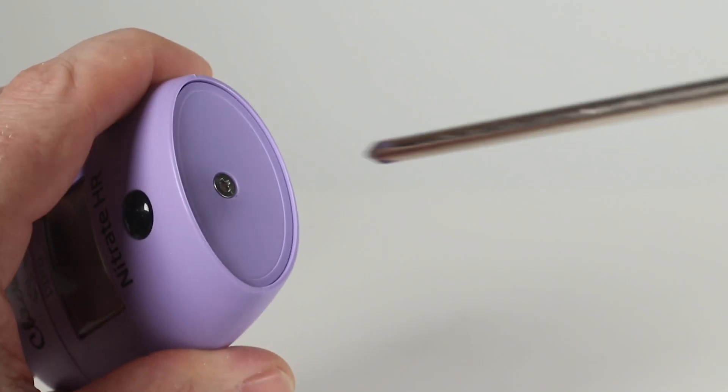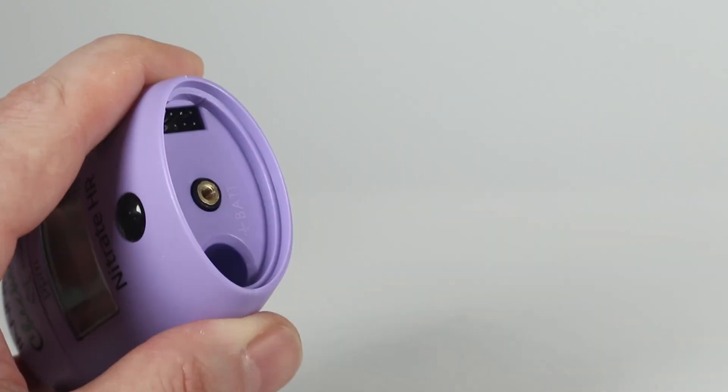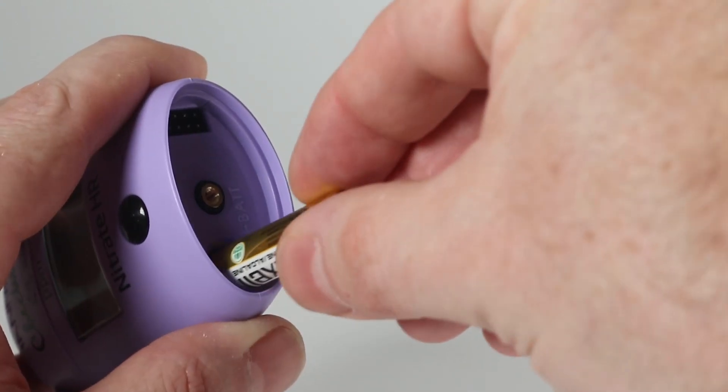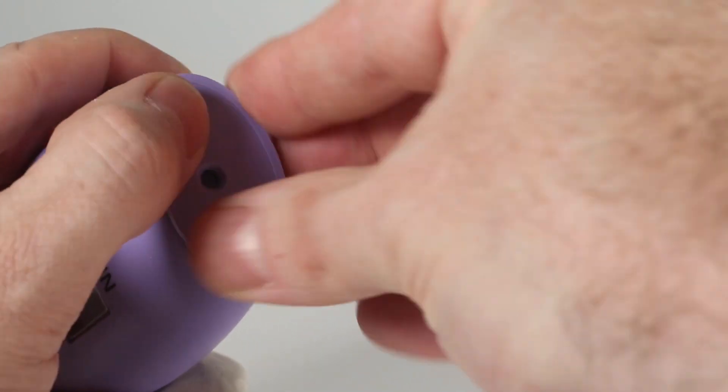Next, remove the screw from the bottom of the checker. Insert the AAA battery. Replace the bottom of the checker and fasten the screw.